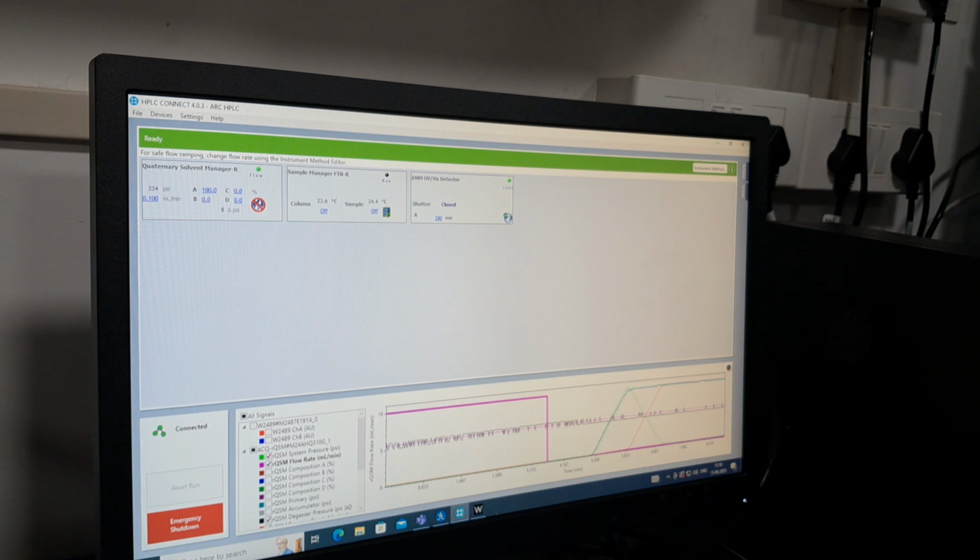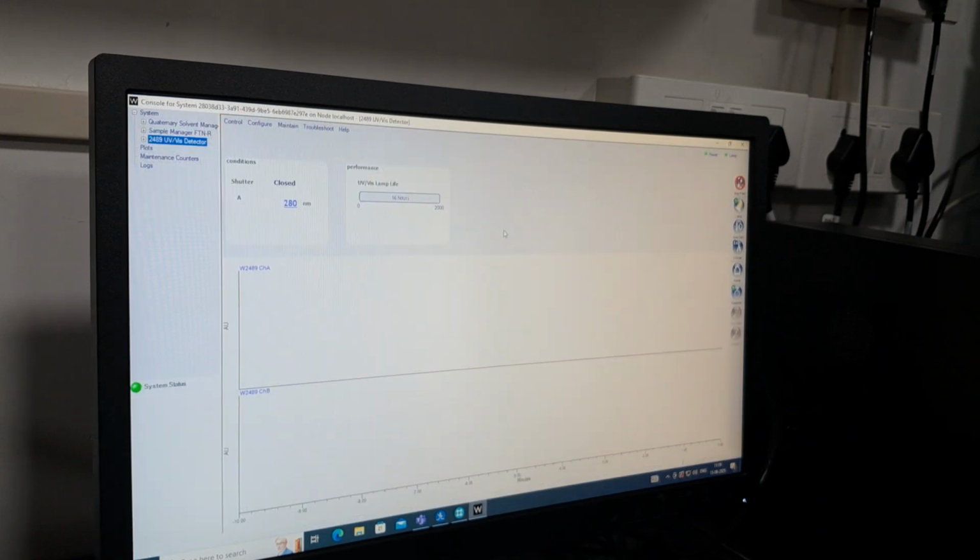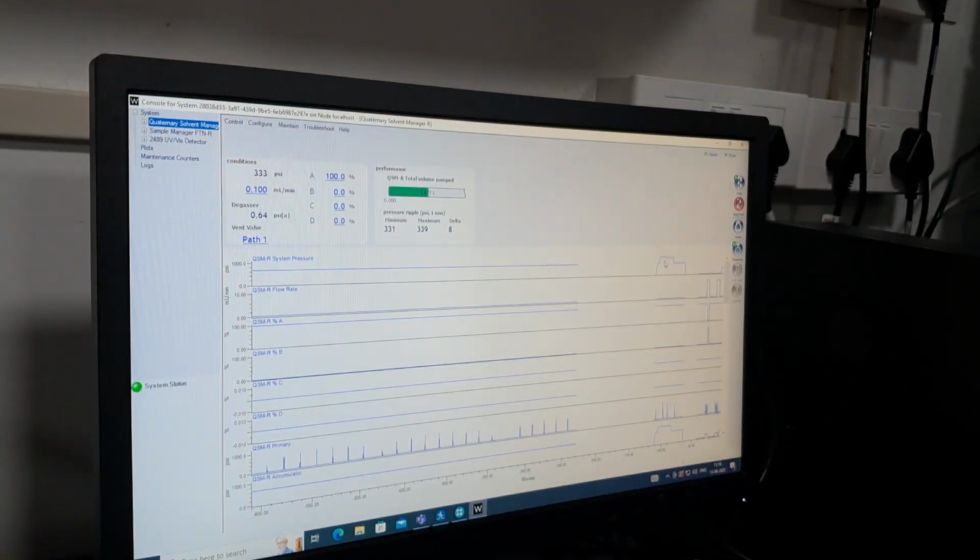When the power went out and again came back, it reinitialized every parameter that was running. That is why it looks erratic. When the power came back, did it automatically start again? No, it never starts actually. It will come to idle only.